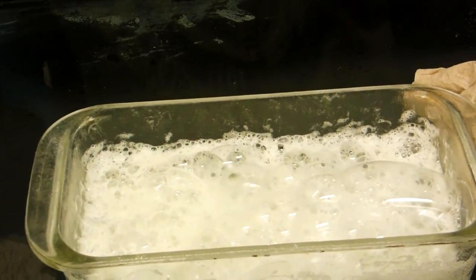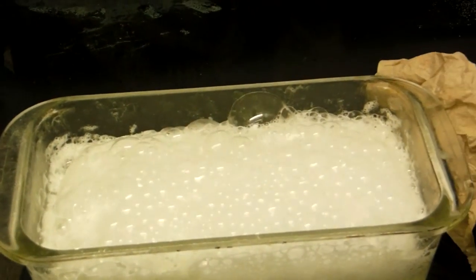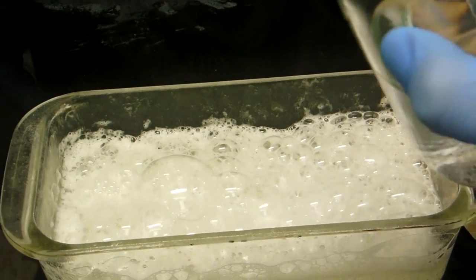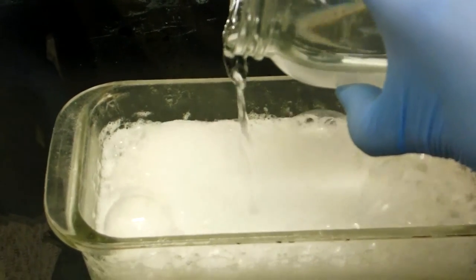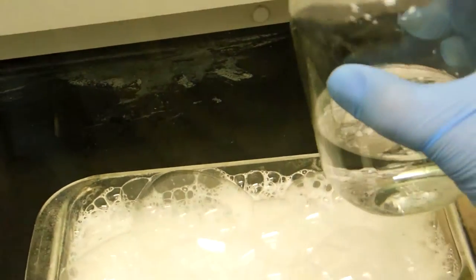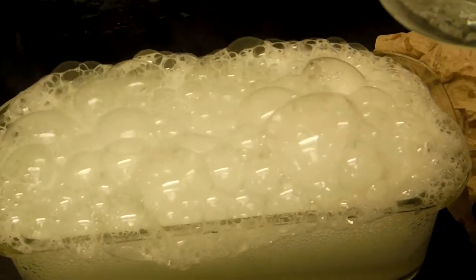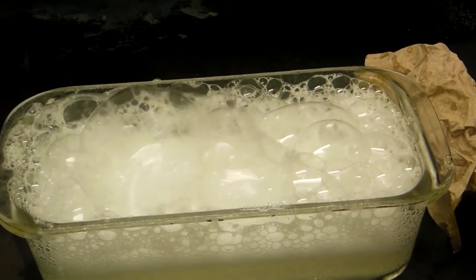So yeah, pretty big bubbles, and there's a lot of vigorous reaction going on. It's also releasing a lot of heat, and gas that's not toxic. As you can see, it even reaches the top of the rectangular container and accidentally it bubbles over. But this isn't a problem because it is neutralized. But it does demonstrate the powerful neutralizing properties of baking soda.